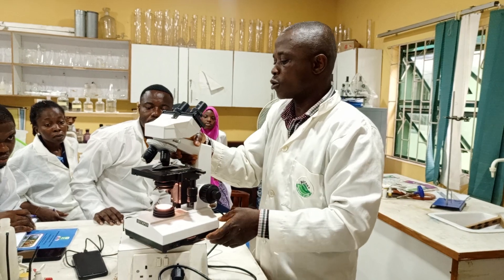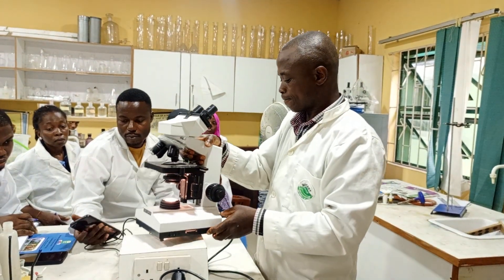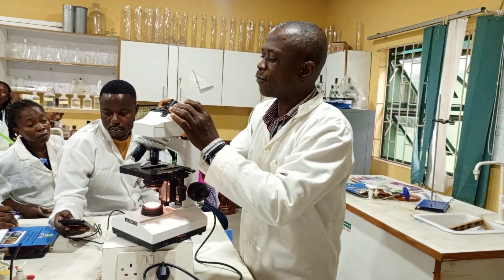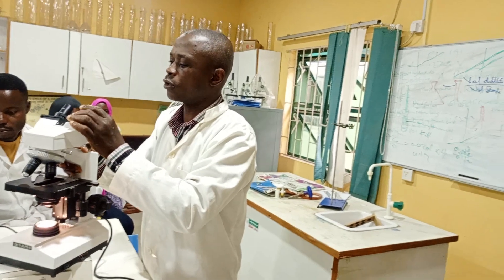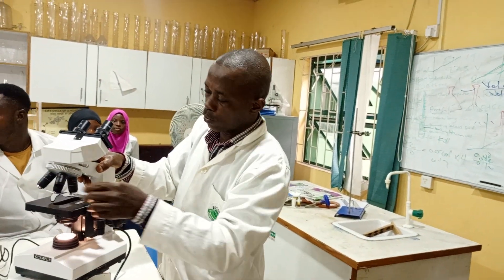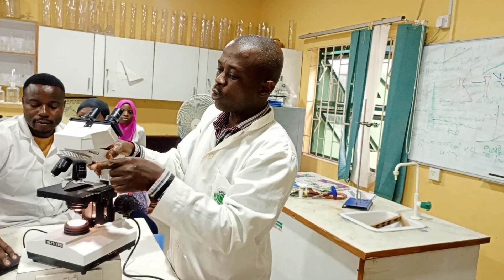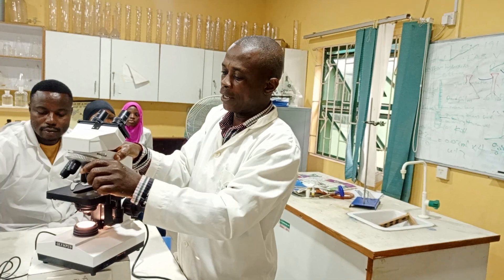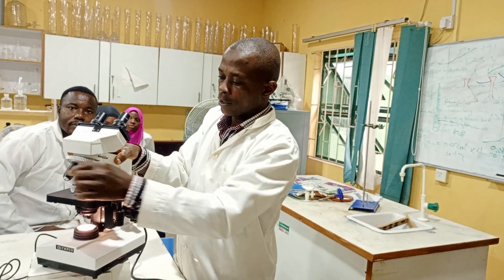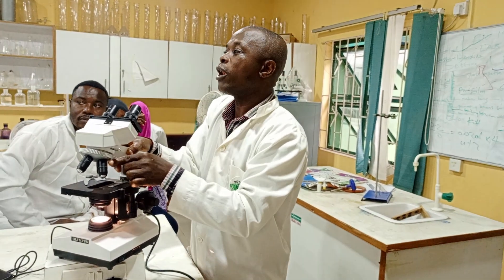This microscope is called a binocular microscope and it's also a light microscope. The eyepiece has magnification, and we also have the objective lens that has magnification. The lowest is times 4, which has a red band. The next one is times 10 with a yellow band. We have blue, times 40. And we have the cream or white one that is times 100.